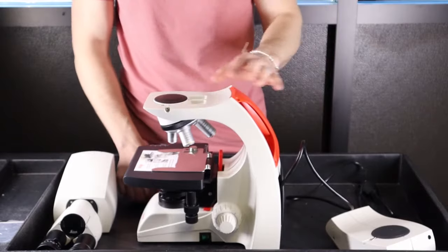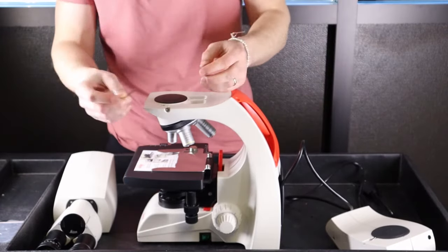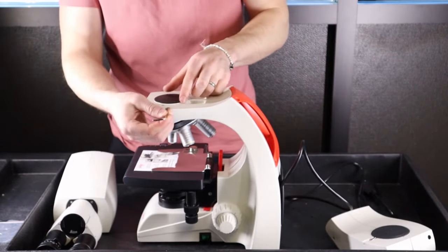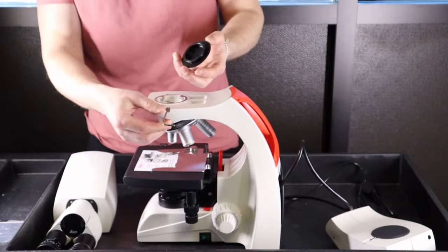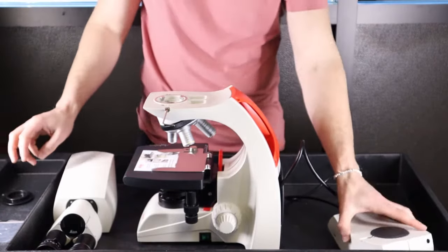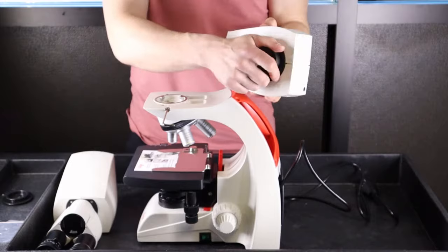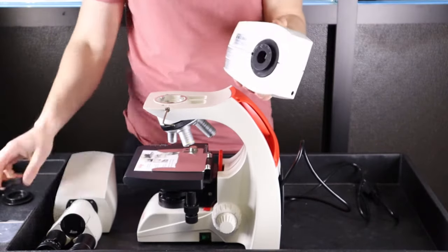Next, you're going to assemble the camera system with the head. Take your allen wrench that's included and loosen this screw here to remove the first black cap. Grab your camera and remove this black cap.